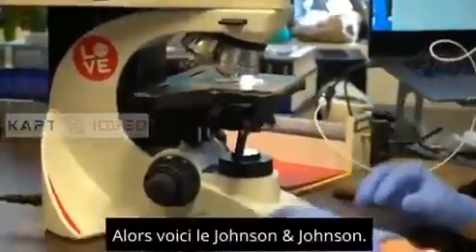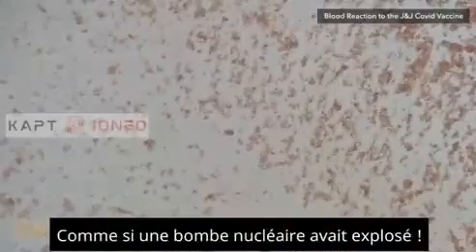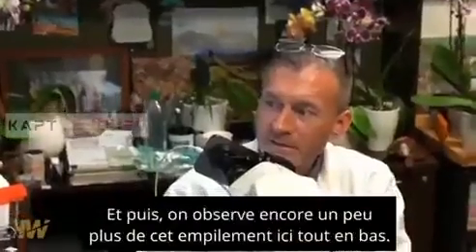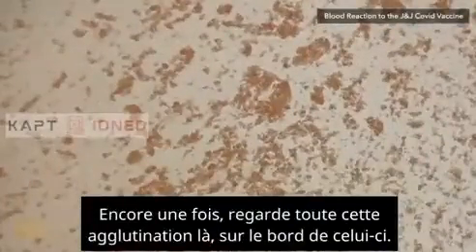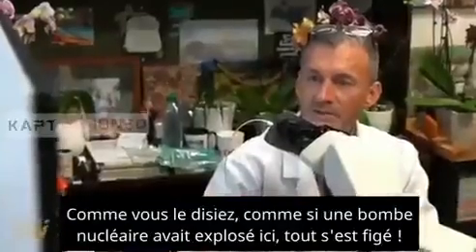So this is the J&J. That's totally different. Isn't it? It's like a nuclear bomb went off. Yeah, it's disordered, isn't it? And then there's a little more of that stacking, that rouleau here. And again, look at all this clumping here out on the edge of it. Yeah. Like you said, like a nuclear bomb went off, it just congealed it.